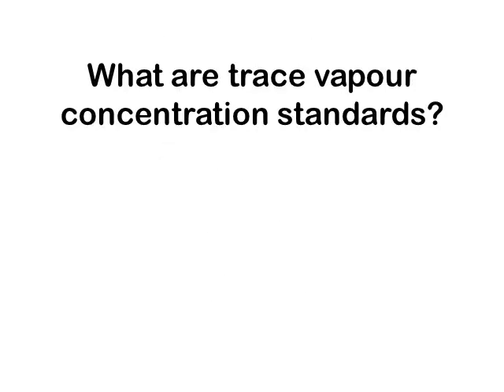What are trace vapour concentration standards? Often we have to generate a very small or trace concentration of a vapour in a flow of gas. Frequently, we need to control reliably the very small concentration of that trace vapour, repeatably and reproducibly, in the diluting gas flow. When we do that, we are then making trace vapour concentration standards. We can use such trace vapour concentration standards for many purposes.